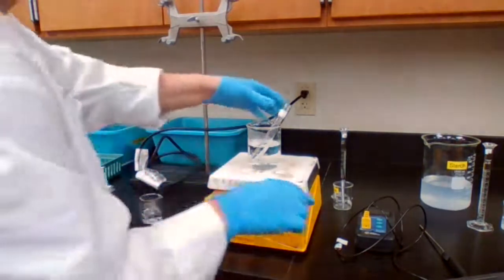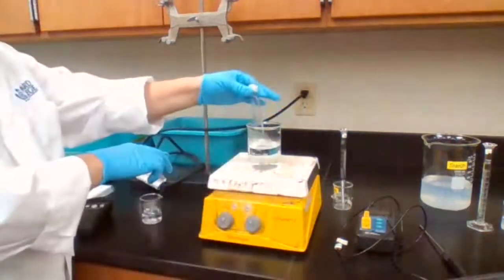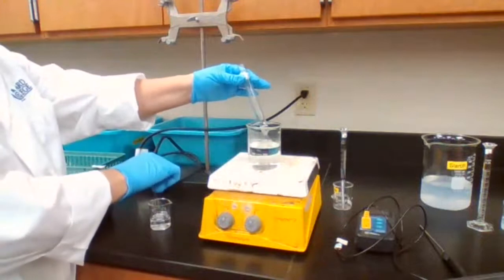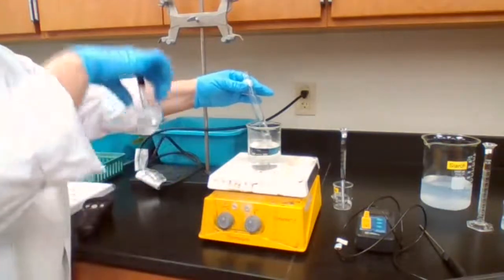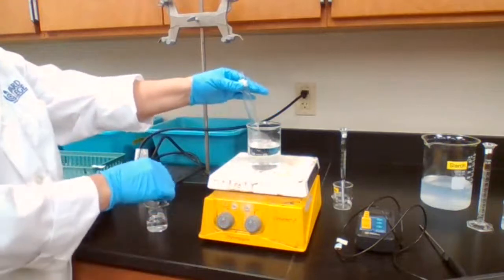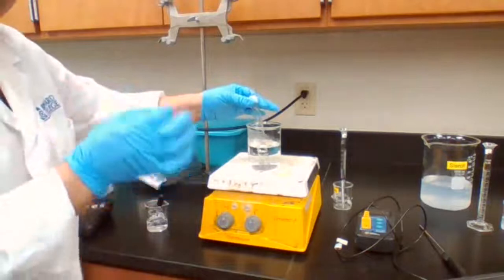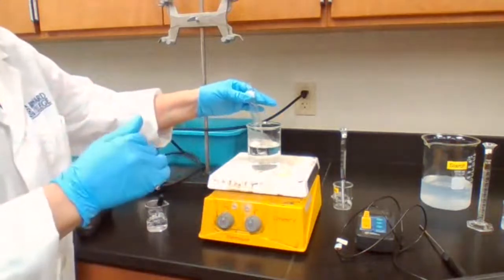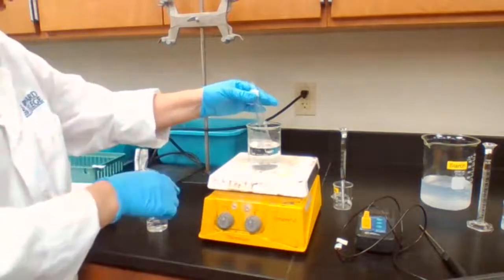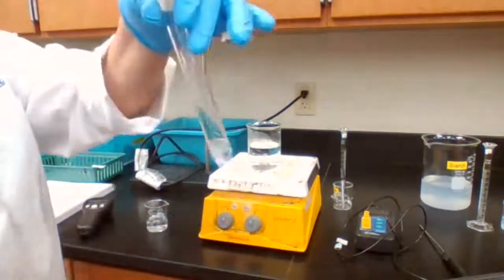Okay. Now, I want to add a few drops of the same solution, the sodium thiosulfate that I had for part 1. I'm going to add it to this. The part that you are monitoring is how fast the white color would change to black color compared to the other reactions that we did earlier. Let's see which one is going to be faster.